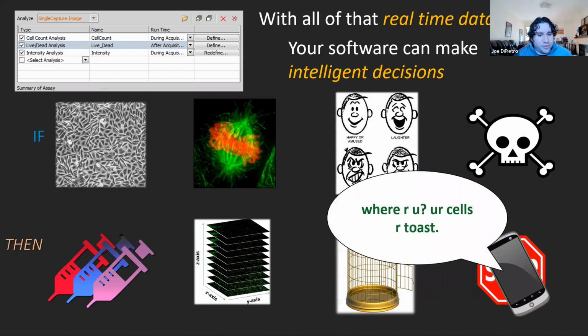It's sort of a little joke there, because if you set it up a certain way and your computer is online, you can actually have it send you a text that it's finished, which is pretty cool too.